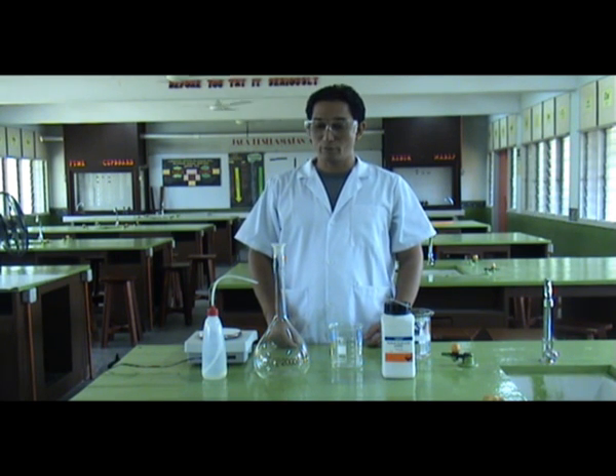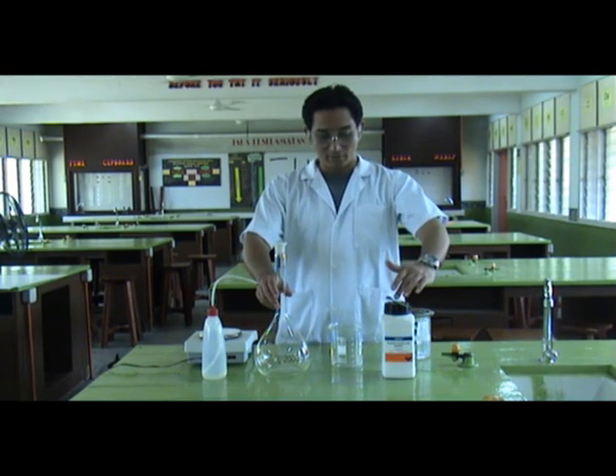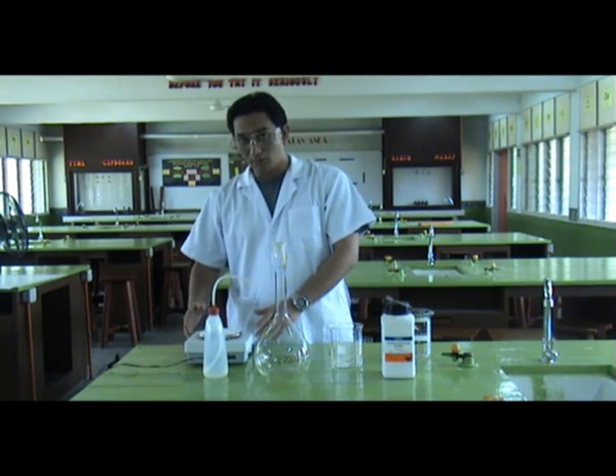The apparatus that we are going to need are a volumetric flask of about 2 litre, sodium hydroxide pellets, a beaker, distilled water, and also a digital scale.